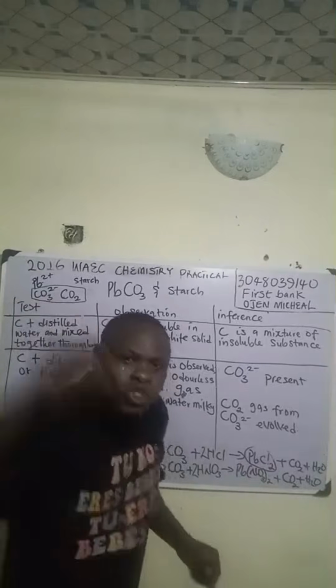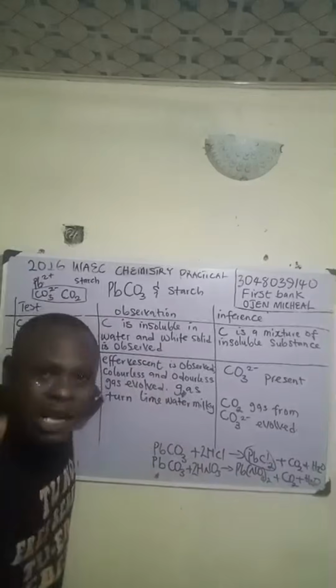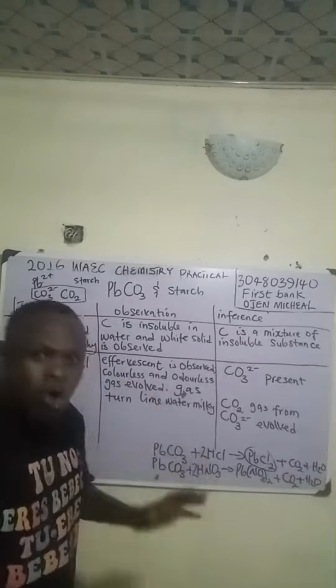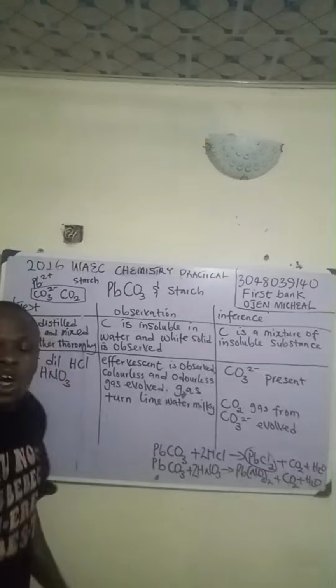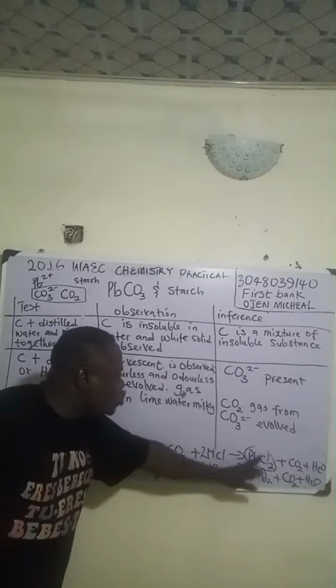I'm giving you this so that in case you are asked in the exam to use HCl, if WAEC asks you to use HCl, you must heat it. That is sure. If you don't heat it, there is no way you get your result. It is only when you use HNO3 that you don't need to heat it. And of course, I've given you this one. This one is soluble, this one is insoluble.